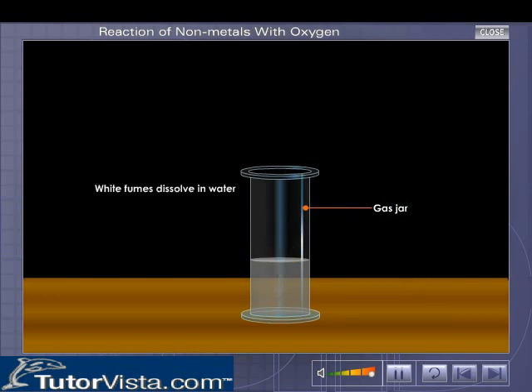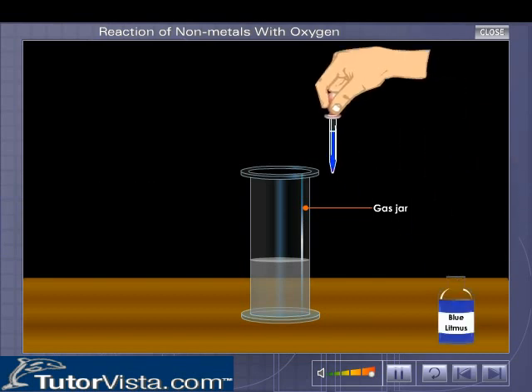The white fumes dissolve in water. Now put a few drops of blue litmus solution into it.